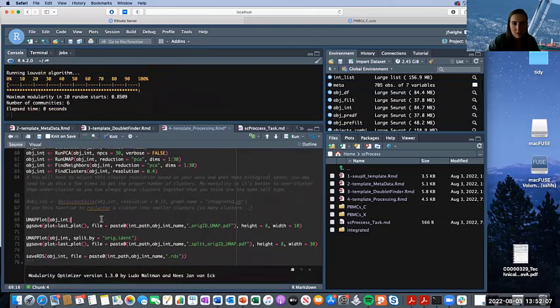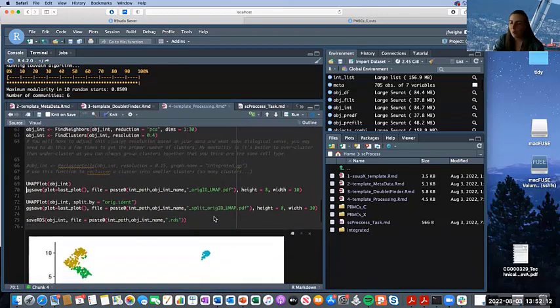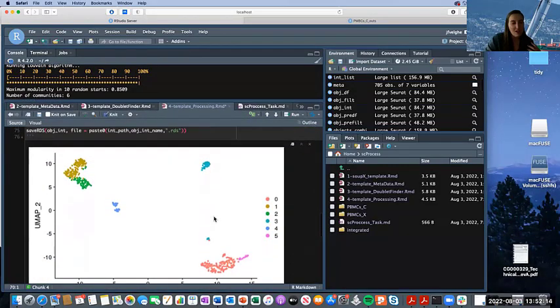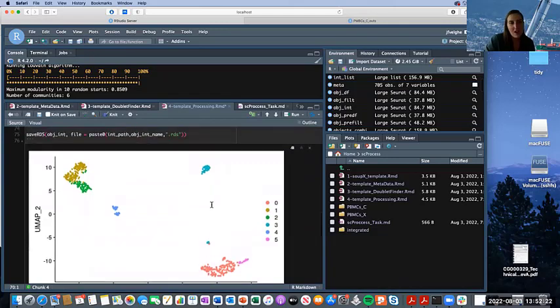Okay. So now we can pull up a UMAP plot of what our integrated object looks like, and we'll pretend that mine's integrated. Woohoo! Okay, so as you can see, there's not a ton of cells. I vaguely know what yours looks like. I have seen it before. I could pull it up, but we're just going to keep going here.